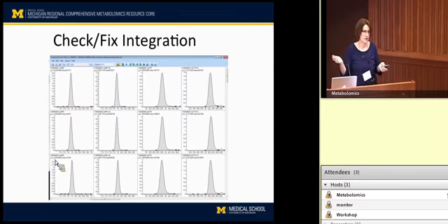And the reason we do that is, we don't use it quantitatively to normalize your samples to it, because that wouldn't really make any sense, but it's the best way to look at the instrument and say, how is it doing with a matrix that is just like what your samples are? So we run this several times during the course of your run. We may run it about once for every 5 samples, maybe once for every 10, depending on the study and what's involved. Each of these chromatograms here represents one of the times we've run that pool. So it's a bit of a quality check to make sure that the instrument's been performing the same way at the beginning of your run as it is at the end of the run. So that's why this looks so good and it's so easy to deal with.